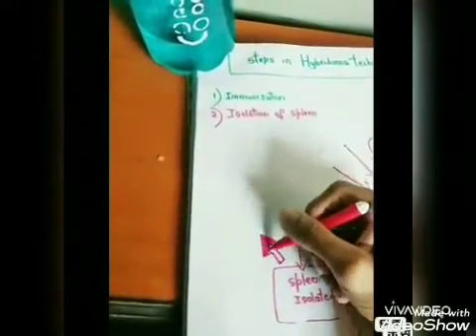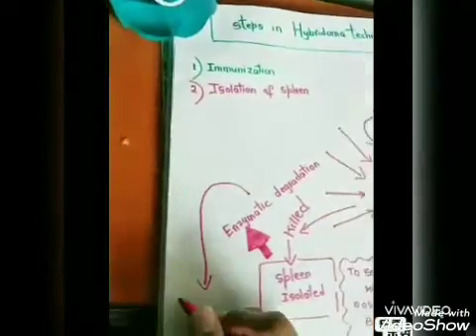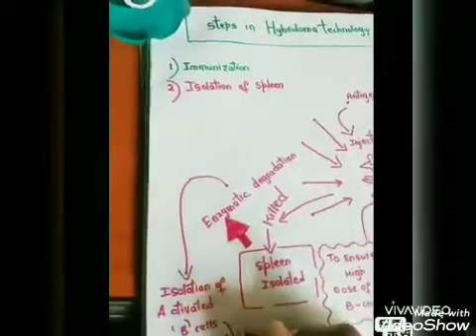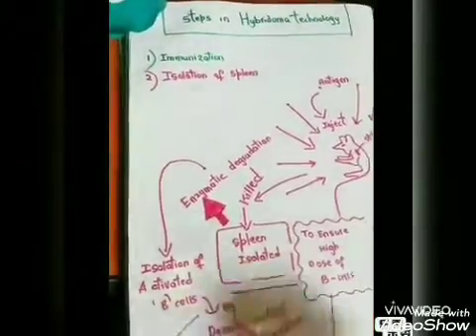After removing the spleen, you're going to enzymatically degrade it to isolate the activated B cells from it, which have already produced the antibodies against the antigen we have injected. Again, this is done by using density gradient centrifugation. So this is the overall two-step process.